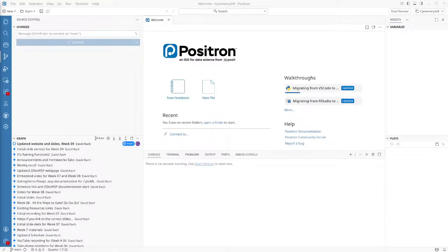Alright, that took a little bit. We can edit that in post-editing. But as you can now see, if we go look at our little graph within our source control, we can see the last change was an hour ago from when we recorded this video, so April 14th, 9:38.